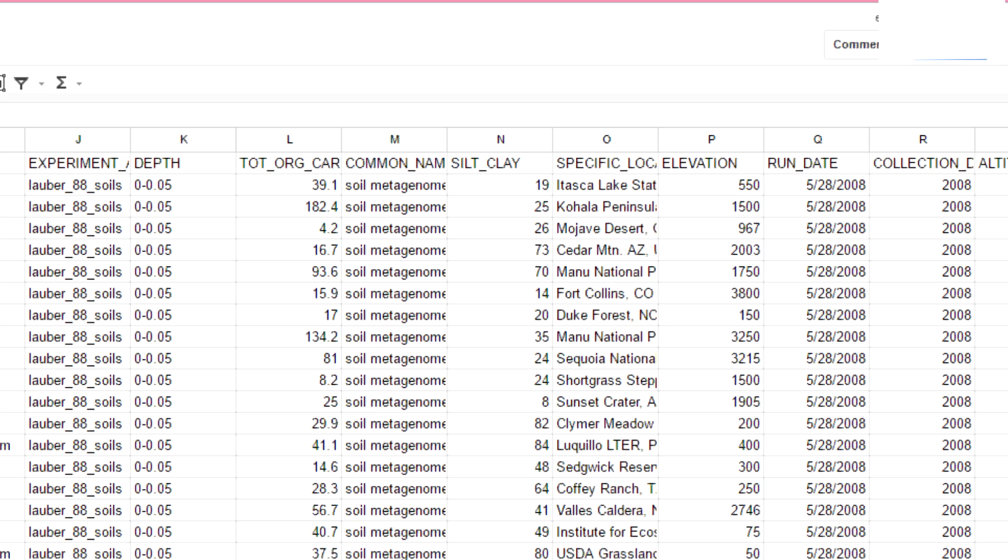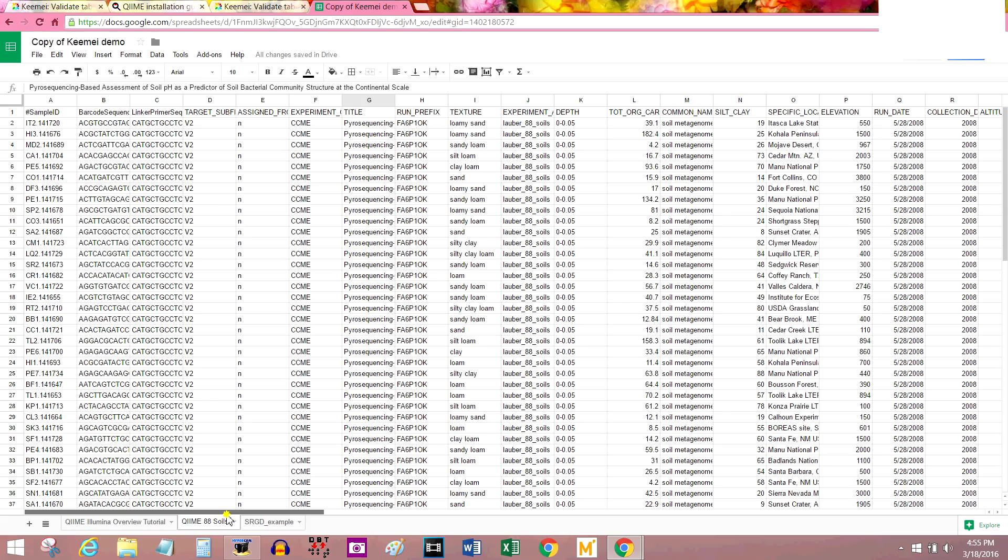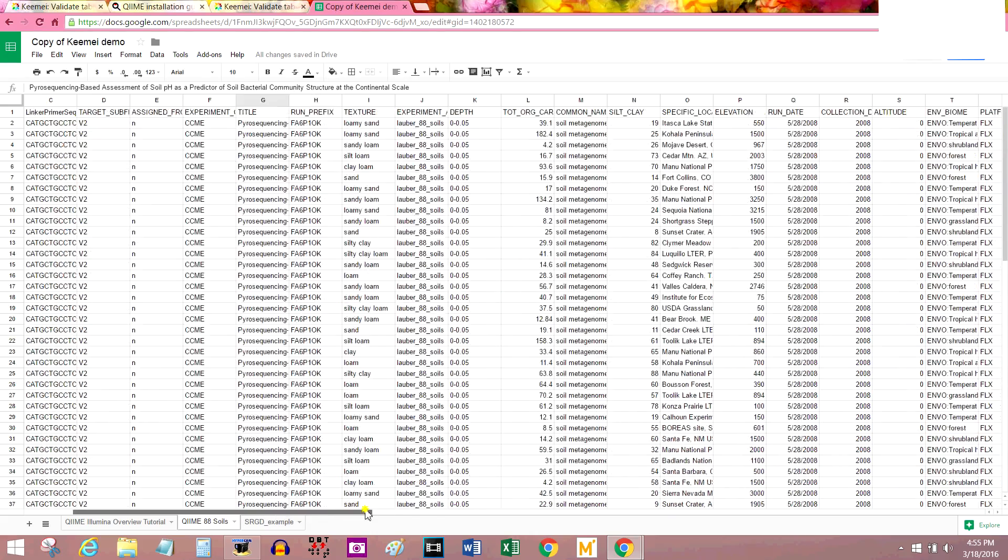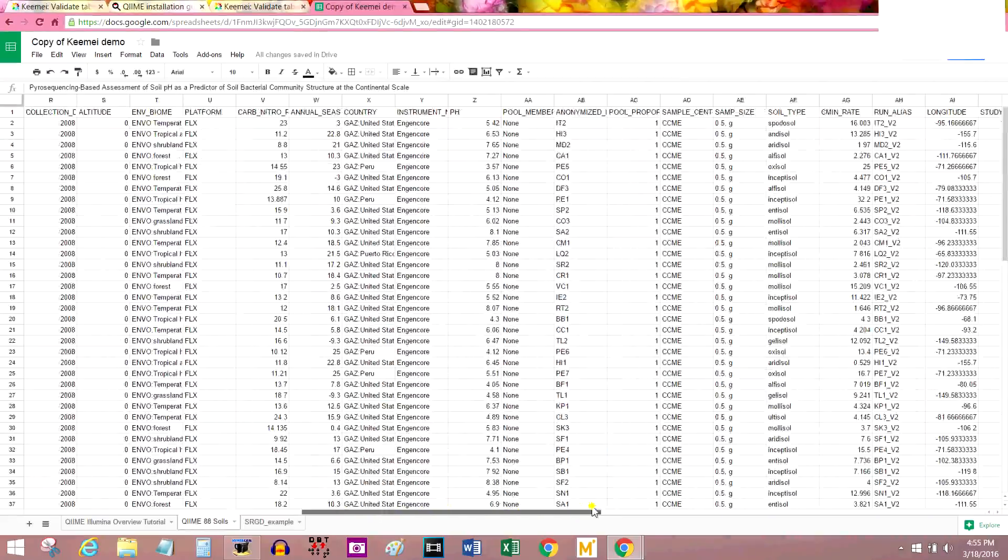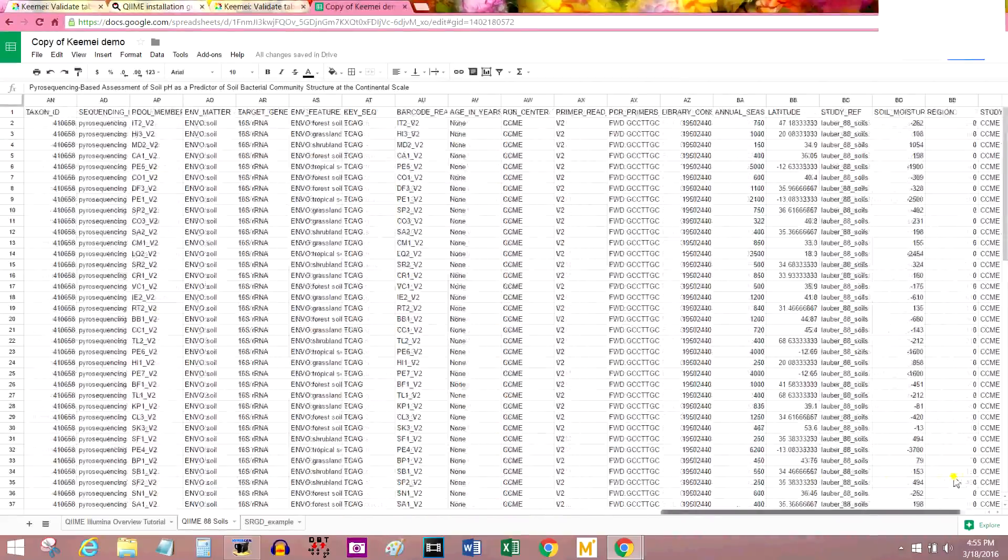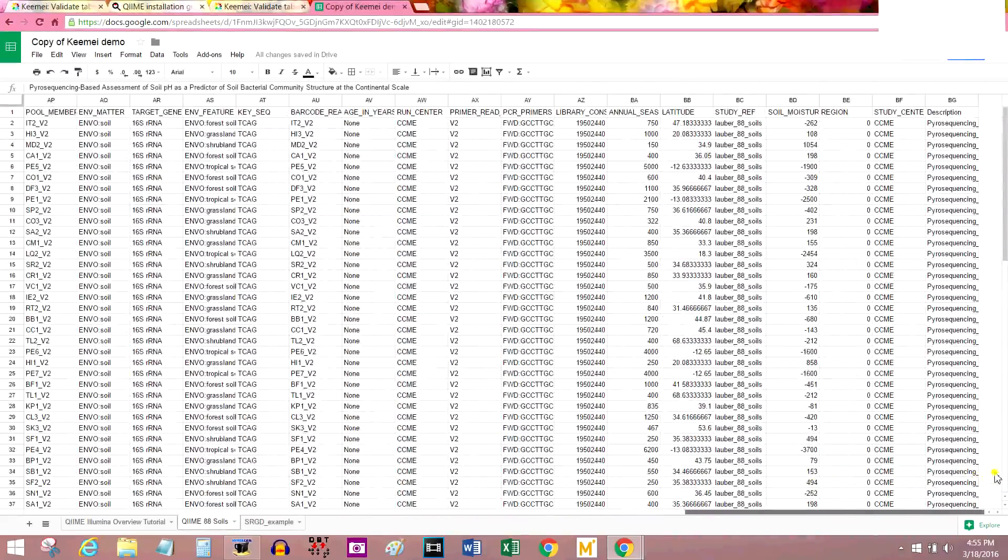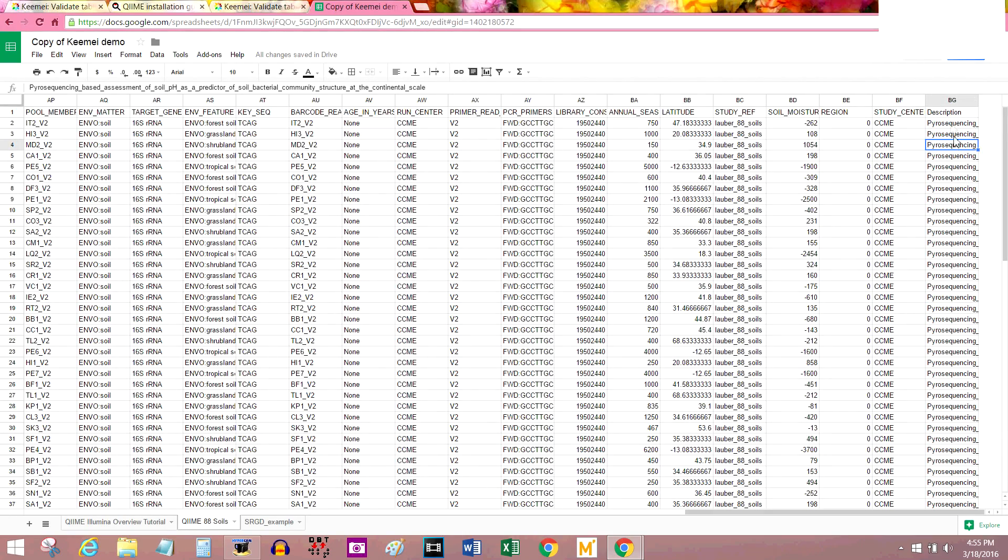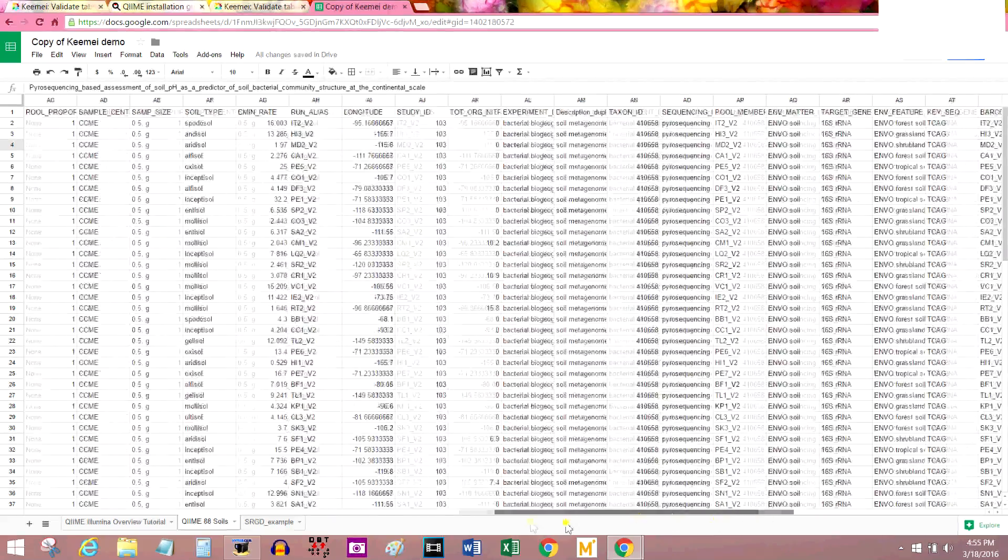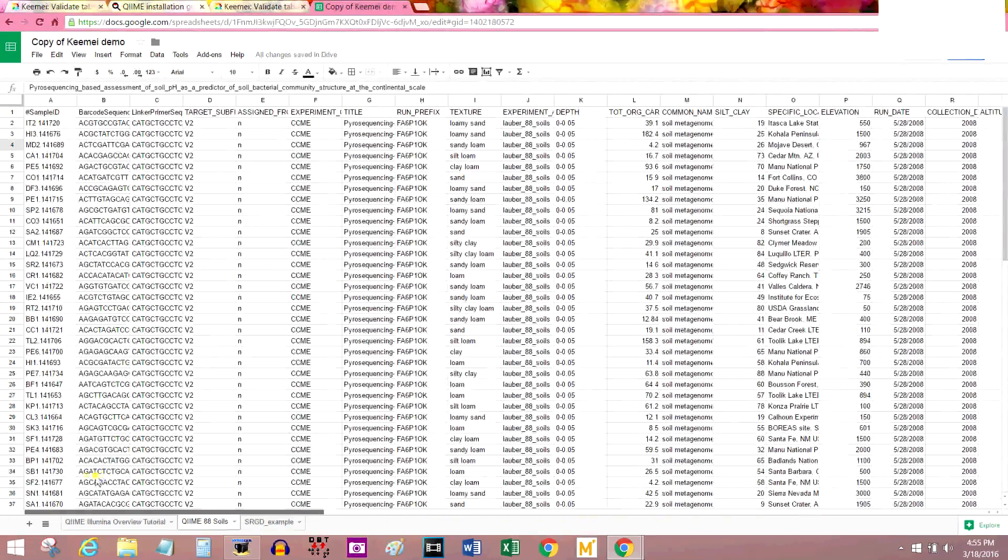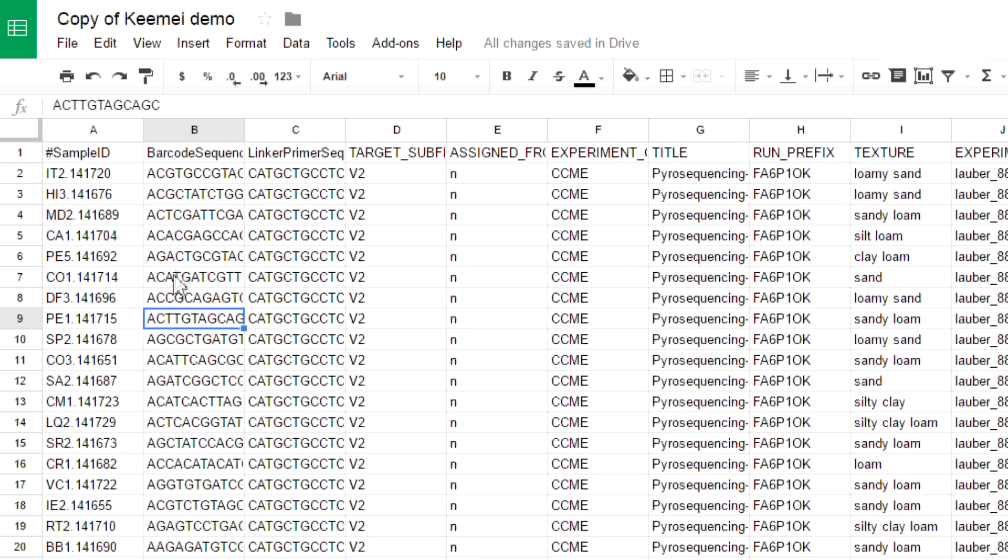So, we could actually go into QIIME and use this data. This sure has a lot of data in it. This is all metadata, mostly. All the way to BG. That is a ton of columns. I would absolutely hate to have to put this into Windows Notepad cell by cell. Separating each cell by a tab. And that's what you have to do for mapping files. Instead, I think I'm going to use a built-in functionality of Google Sheets.